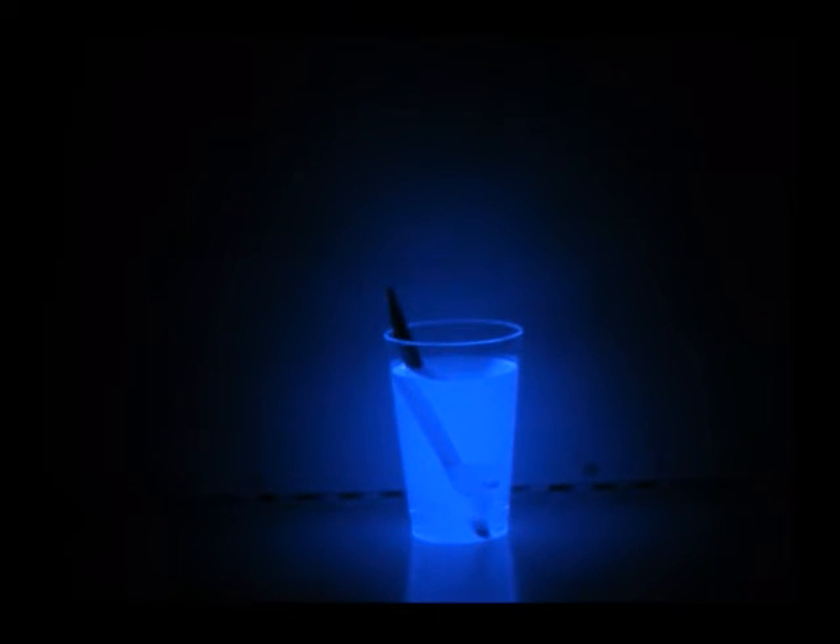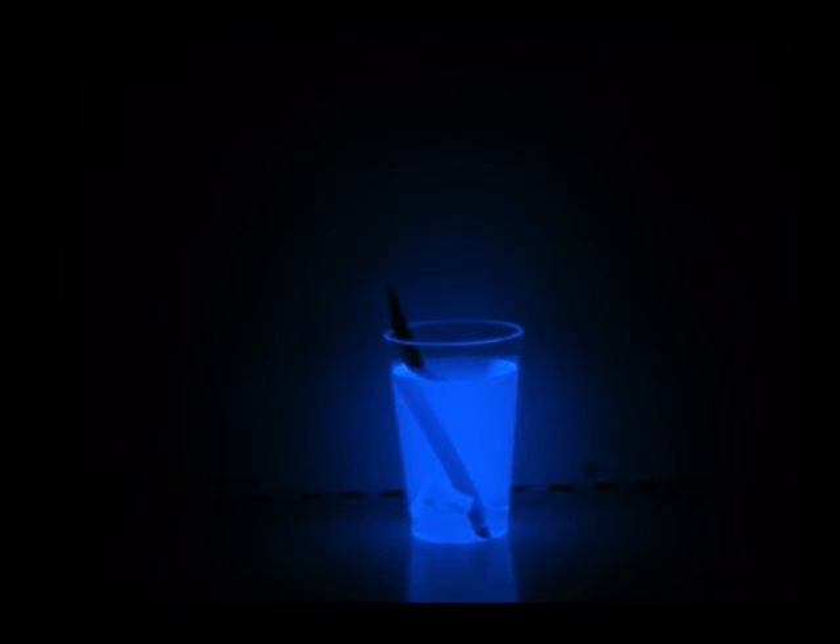This test is of course used for the forensic detection of latent blood. Again, potassium ferricyanide can be used in place of the blood.